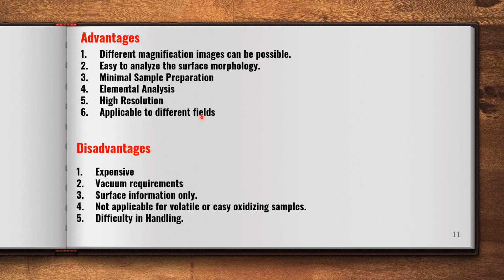It is applicable to different fields, like material science, biomedical fields, biotechnology, or anything. If you want to see bacteria or minute objects, there is a possibility, but not for volatile compounds.